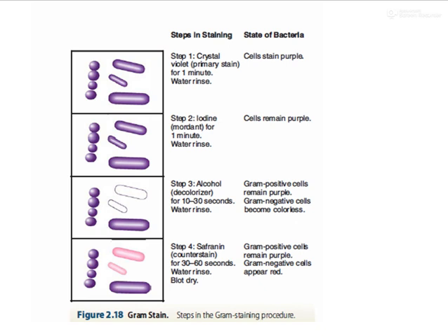And as a result, what will happen? All the bacteria will take up crystal violet, because, as I told you, all the bacteria are considered to have a negative charge. So they will take it up because crystal violet is a basic stain. Here, all the bacteria on a glass slide, even if it has two different types of bacteria, will take up the crystal violet and they will appear purple in color. And after that, you add another thing called iodine.